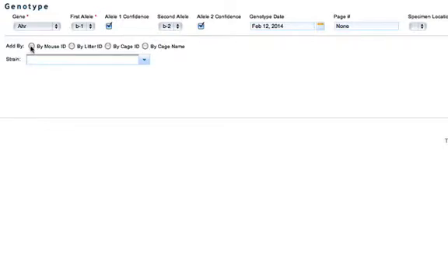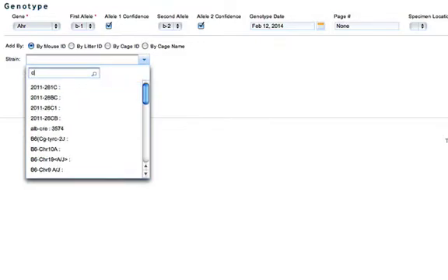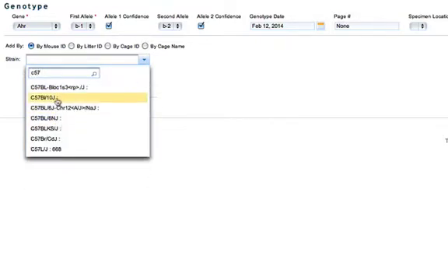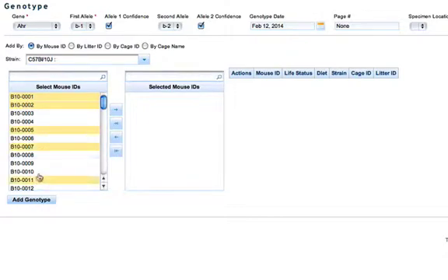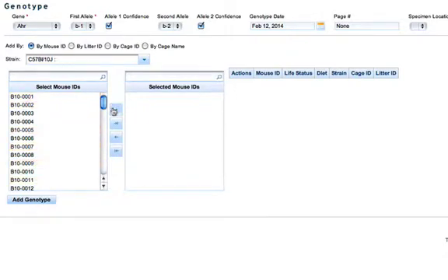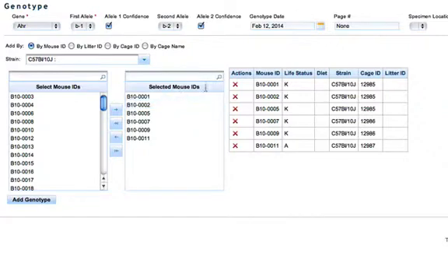I'll add by mouse ID and then select a strain. Then I'll go ahead and select multiple mice and move them over to the selected mouse IDs section.